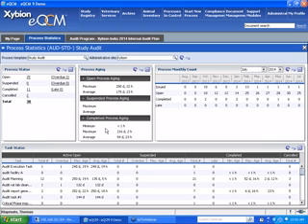It has the aging, so your process aging, your suspended, and your open aging. So how long, what's the longest open audit that we have? And then it breaks it down by month. And so here we can see in October we had 10 issued. There's 10 open, 2 were completed each month. So you can get your stats there.